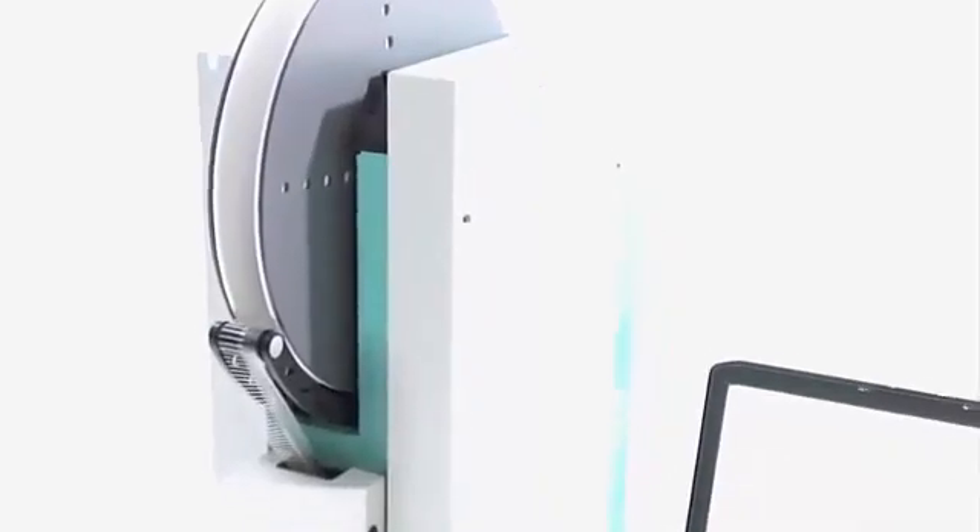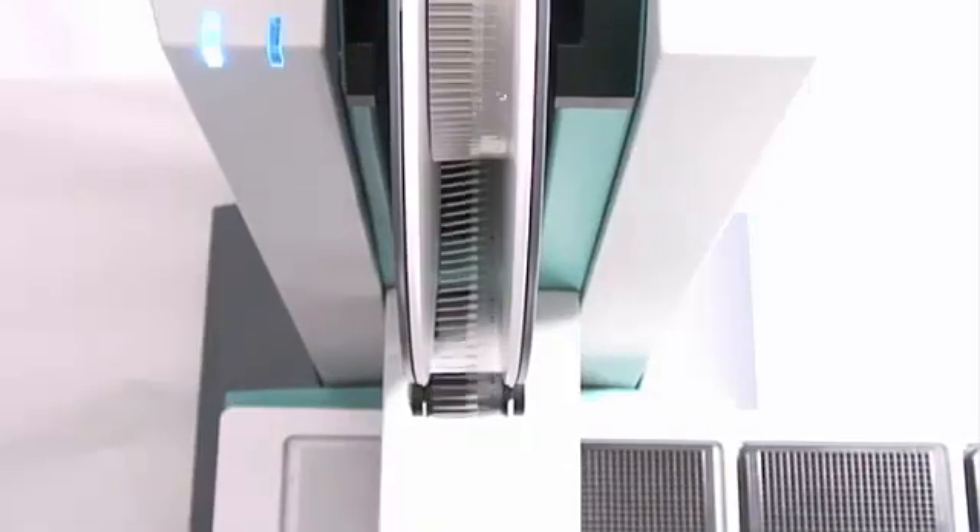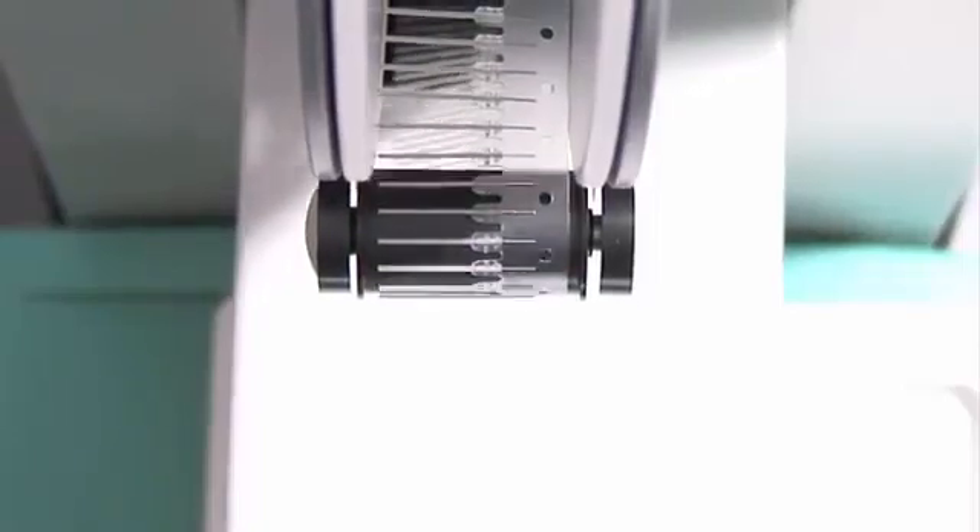It is extremely flexible and extremely fast. Another key benefit is that the pipettes are disposable and hence there is no chance of cross contamination, which is a particular issue at such low volumes. The pipette tips are uniquely stored on a continuous spool, meaning that storage is extremely high density — 36,000 tips can be stored on one spool, which is only about this big.